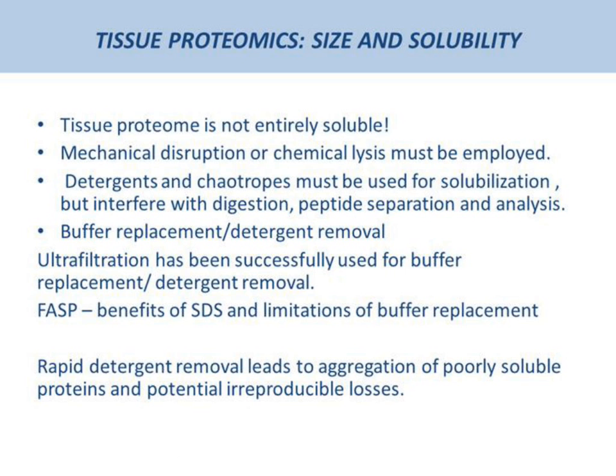Even though mammalian tissue cultures and soft tissue samples are relatively easy to lyse in chemical lysis buffers, the use of salts and detergent necessary for such lysis steps presents significant problems with enzymatic digestion, chromatography, and mass spectrometry downstream. Those chemicals generally have to be removed soon after lysis.